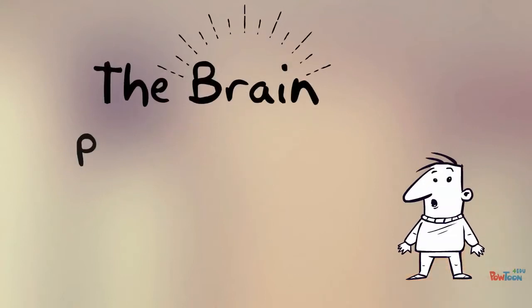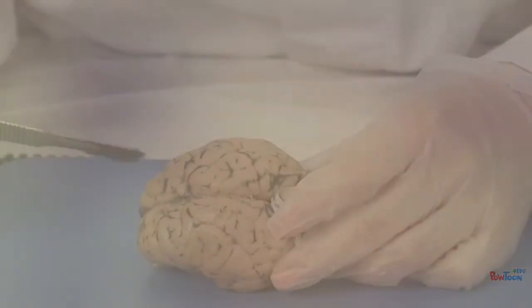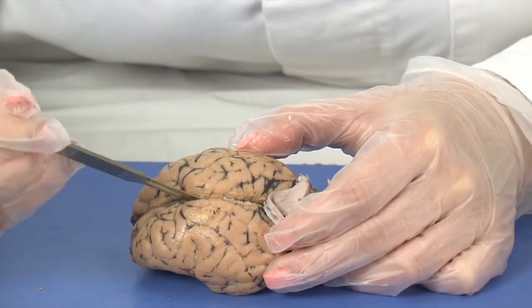The brain, Part 2, lateral view, cross-section. Make a gentle incision through the corpus callosum to separate the hemispheres.